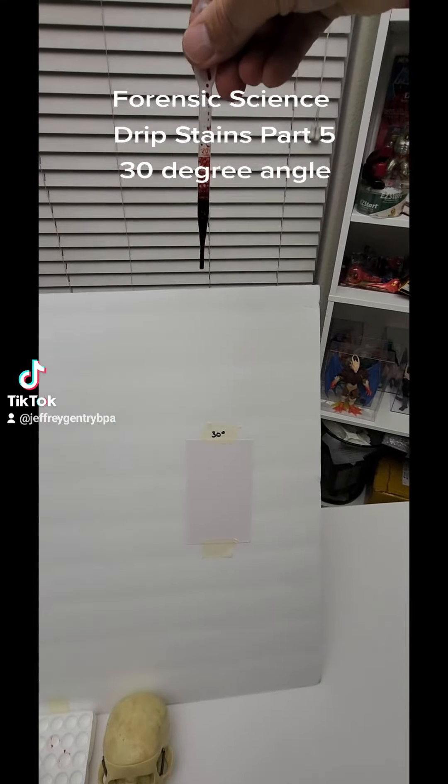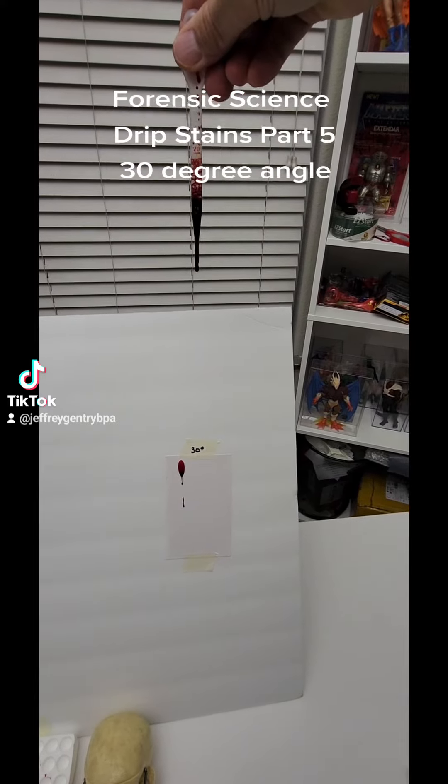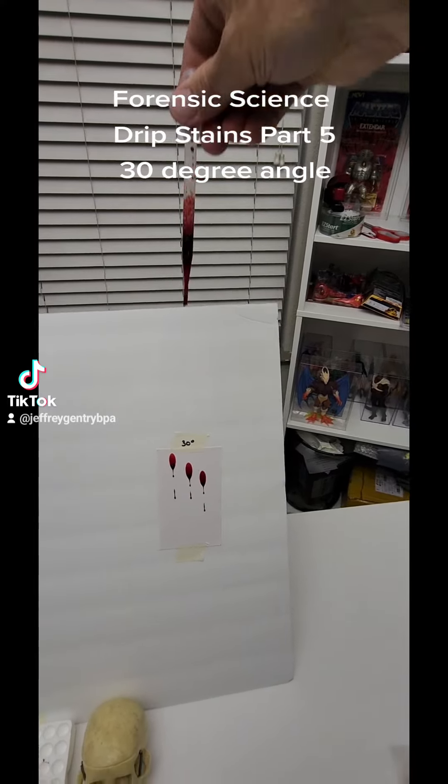I'm going to go at about two feet. So one, two, three. It came out perfect.